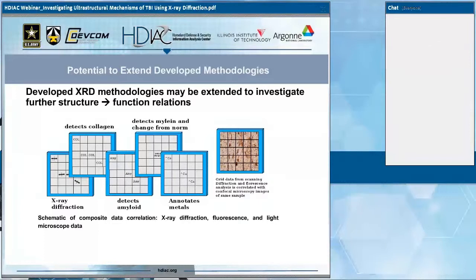we're able to, as we've shown with some of the earlier images, go into each of those areas of the scan, anywhere that we've hit with X-rays, and pull out potentially angstrom level information as to what might be occurring in that area, and under ideal circumstances actually do a true structural solution as well. We can use principally the same equipment to collect X-ray fluorescence at the same time, which is extremely useful for picking up on what kind of metal, or as we annotate in this particular image, calcium. We can go down to about calcium size in terms of X-ray fluorescence.